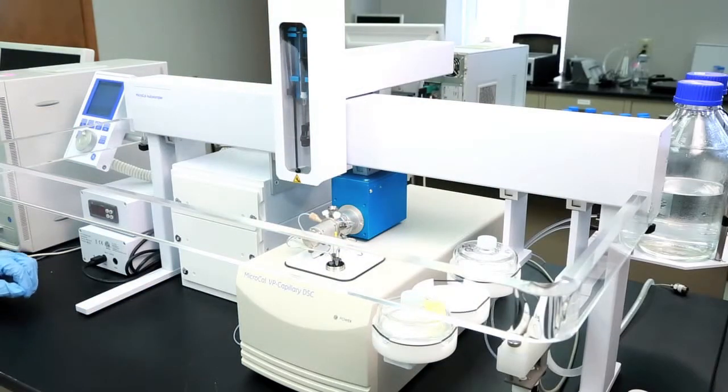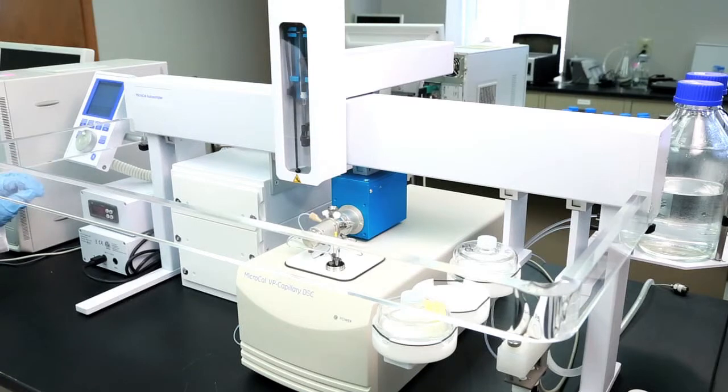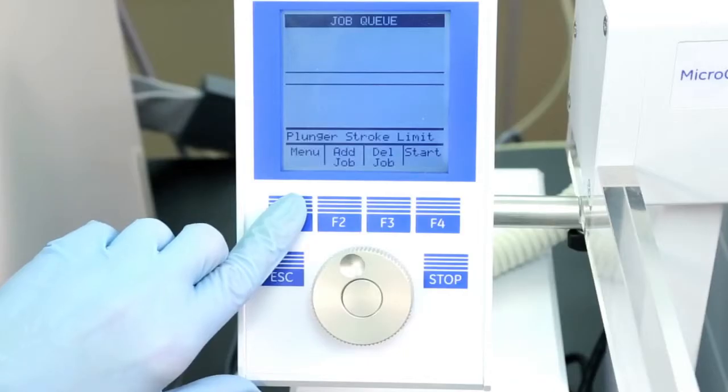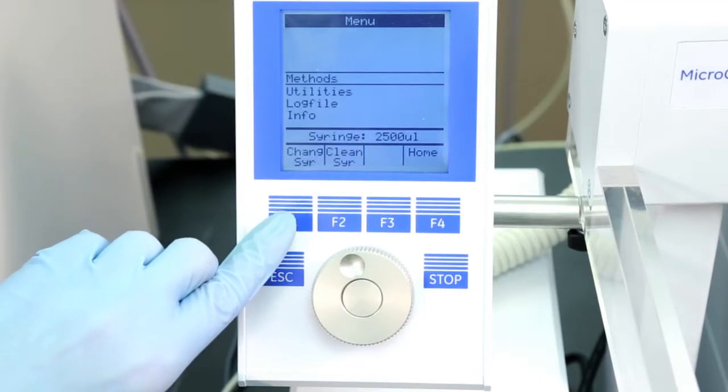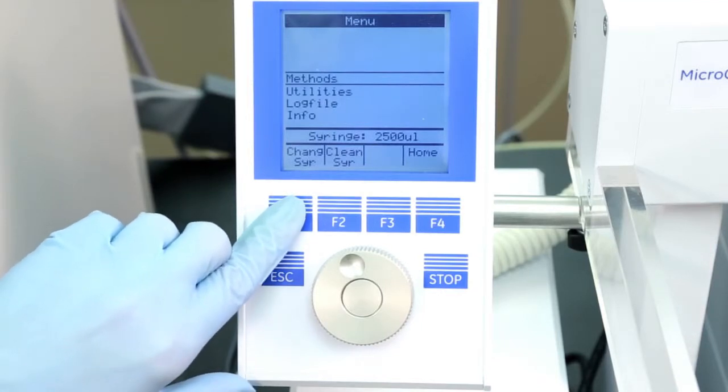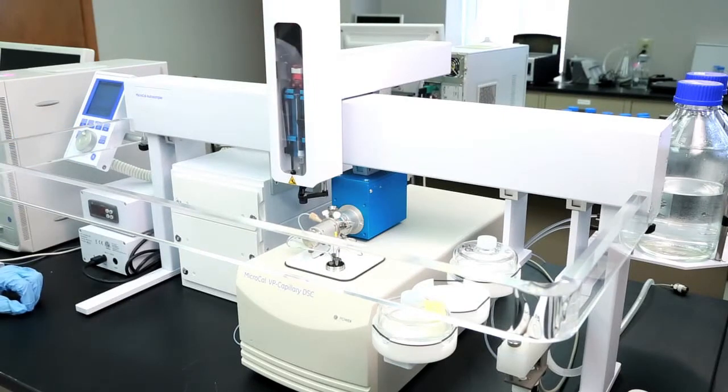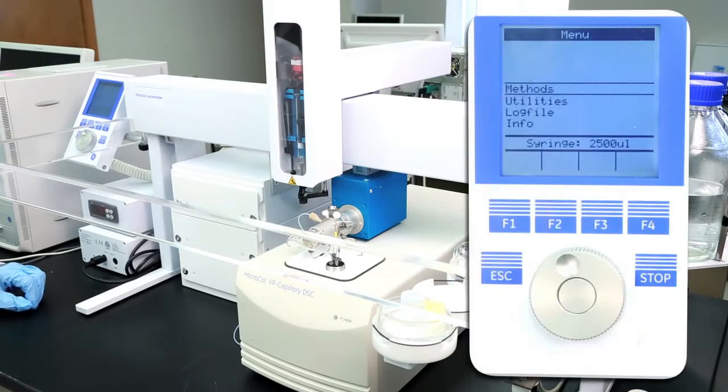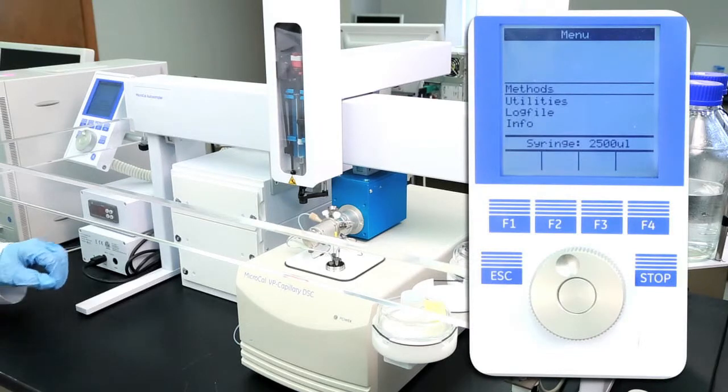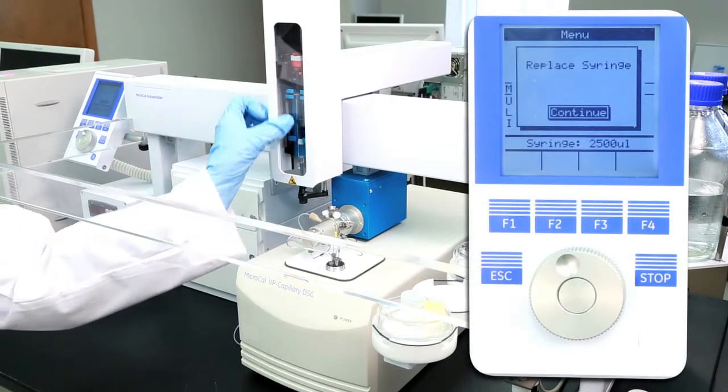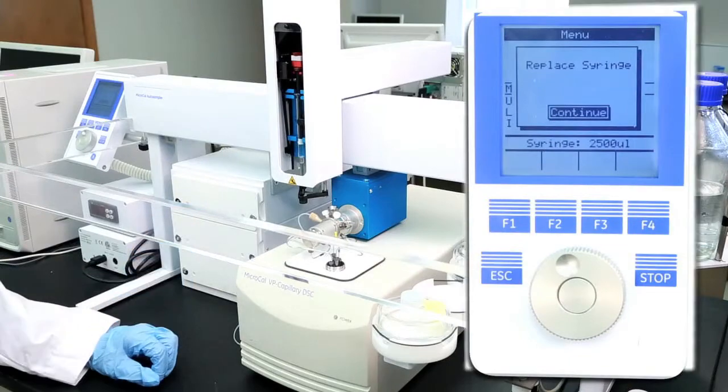To remove the syringe you first have to get it in the appropriate position. Press F1 on the console of the auto sampler and then F1 again to change syringe. The syringe will then move to a position where you'll be able to remove it. Open up the sliding door to access it.